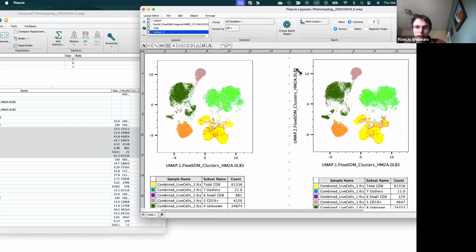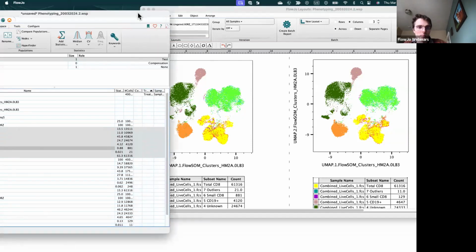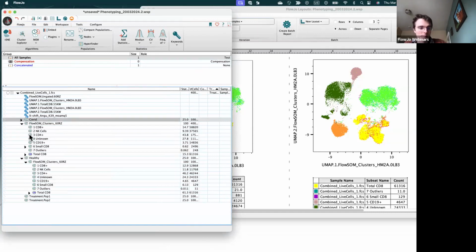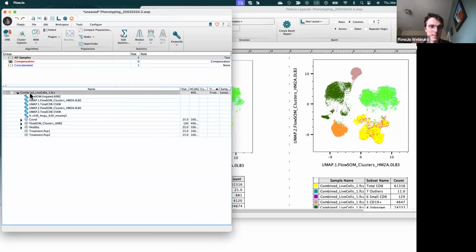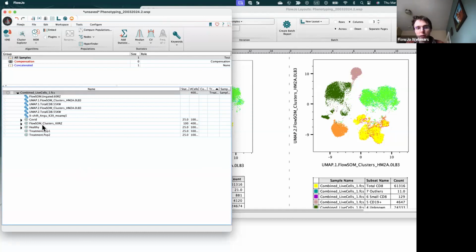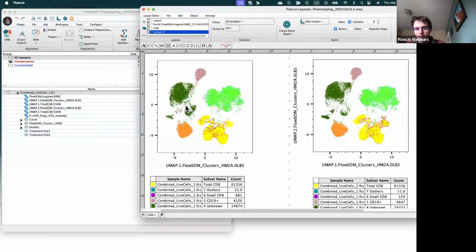other questions. Okay, so yeah, let me go ahead and do T-Rex, why not? Still have 25 people here. So with T-Rex, just to show, because it's kind of neat. Oh, T-Rex isn't loaded. I wasn't planning on using it today, so it's not loaded. T-Rex lets you compare these two conditions, and it will really highlight the little changes between the two conditions.